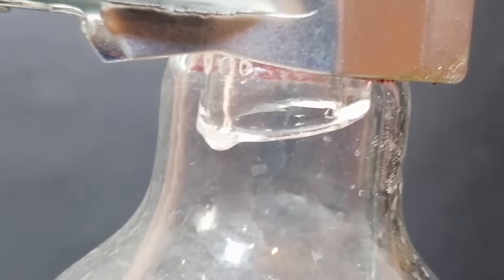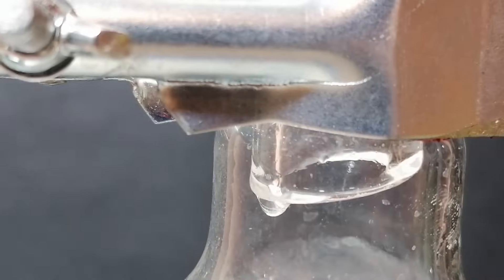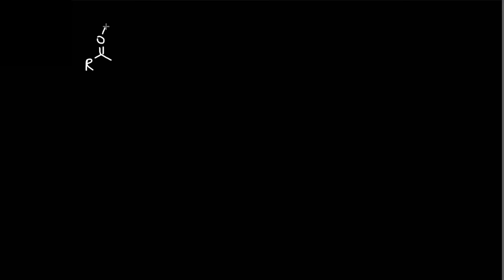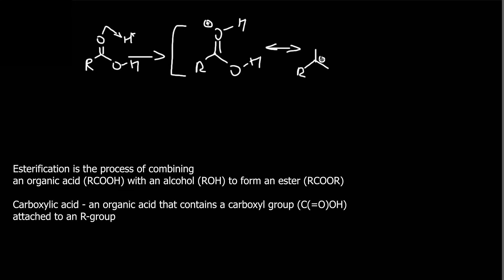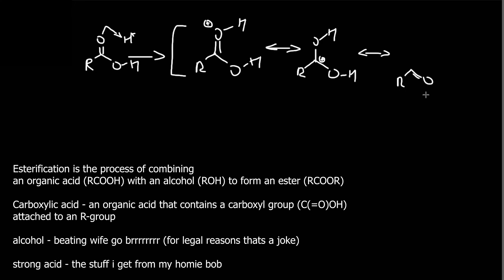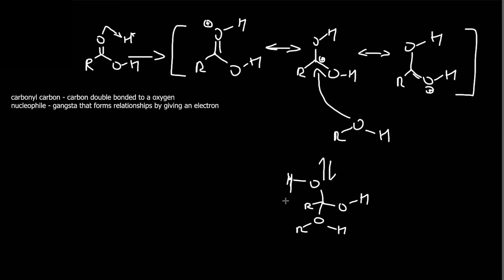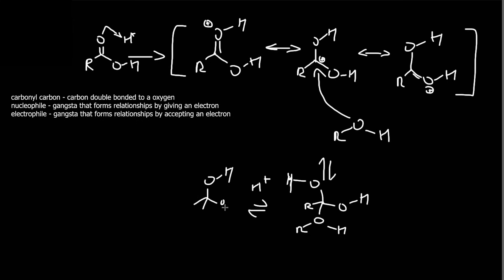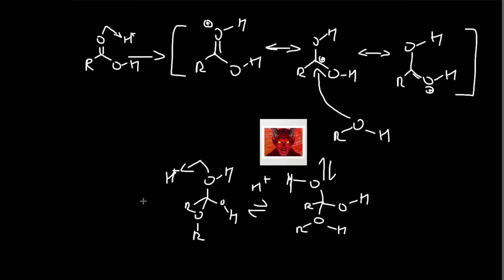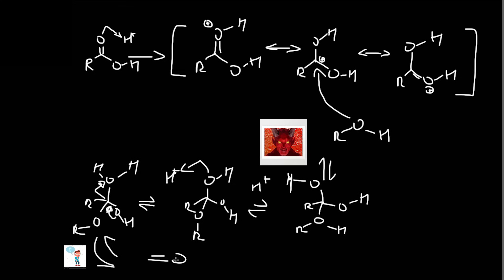I've cranked up the heat and eventually the solution began to vigorously boil. You can see by the droplets that the condenser column is working. What we're carrying out here is a Fischer esterification reaction. Fischer esterification is the esterification of a carboxylic acid by heating it with an alcohol in the presence of a strong acid. It is an example of a nucleophilic acyl substitution based on the electrophilicity of the carbonyl carbon and the nucleophilicity of the alcohol. The nucleophilic oxygen of the alcohol attacks the carbonyl carbon, after which a proton transfer occurs, then a protonation, and the loss of water gives us an ester — in our case, isoamyl acetate.